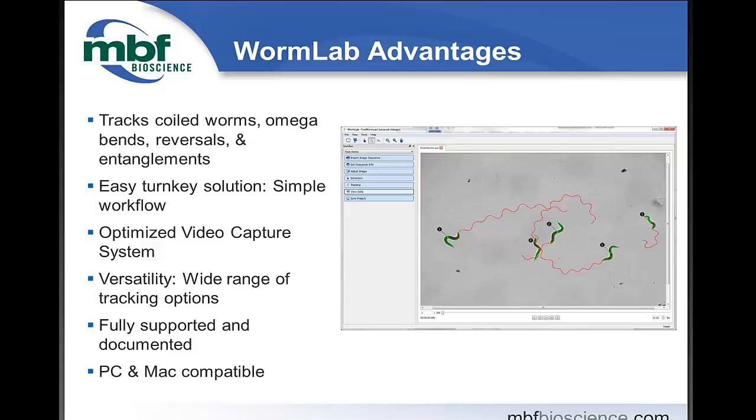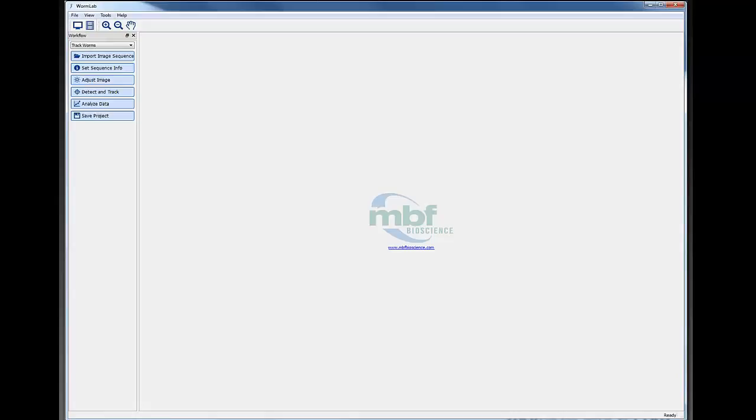We have a question that asks, what's the limit for the number of worms interacting that you can reliably track? This webinar participant deals with worms that clump at the edges of the bacterial food source. So I'm going to just open WormLab here for a second, and I'll give you an idea of what does not work. Let me see if I can find that here. One second. Yeah, so this doesn't work, right?